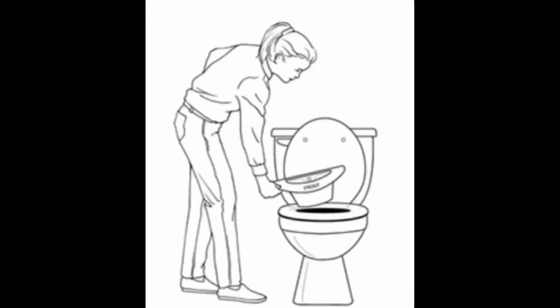In the case of female patients, they should place a urine hat in the toilet under the seat and then transfer the urine into the bottle with a funnel.